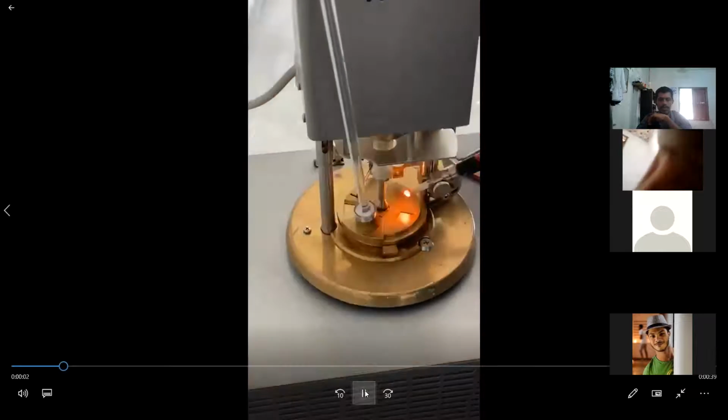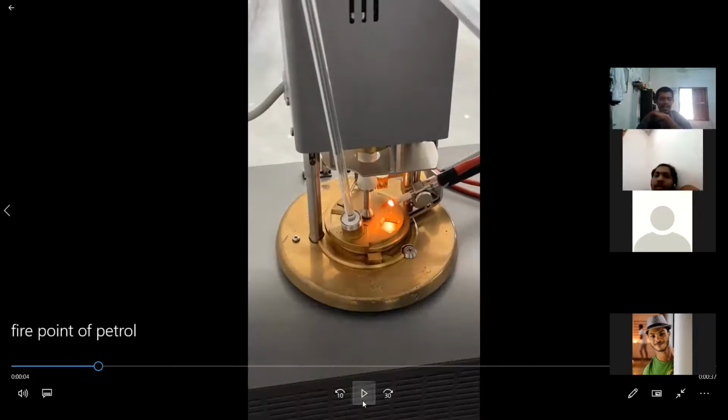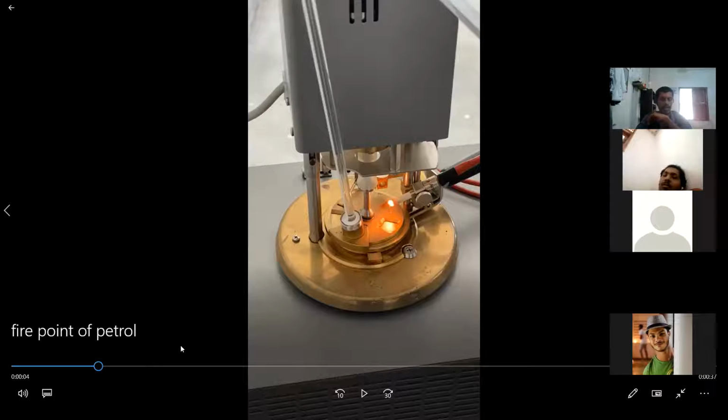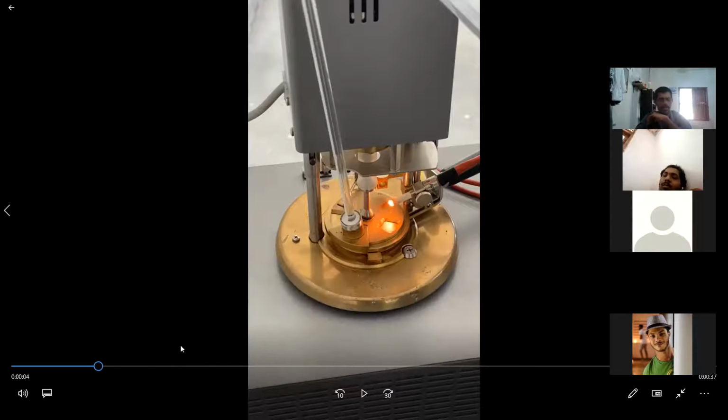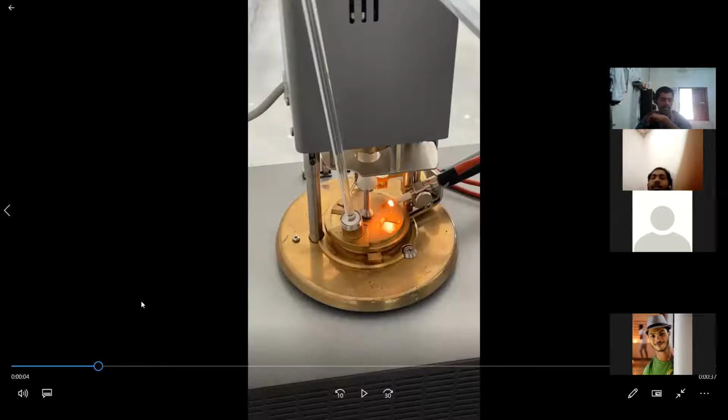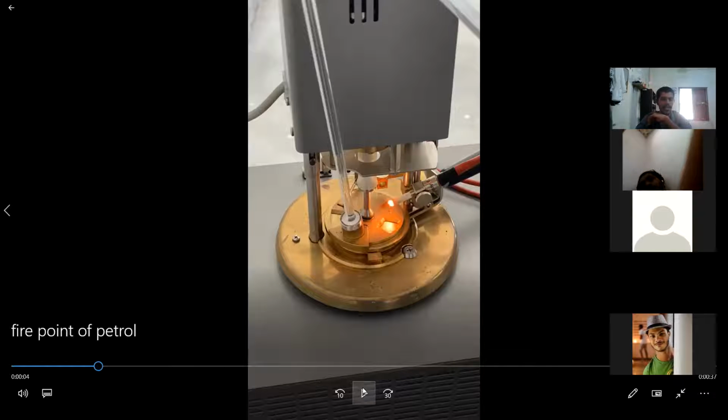You can see it is a yellow color flame now. When the flash occurs, it is mostly a blue color flame. And when it reaches the fire point, it burns for more than 1 or 2 seconds, burning continuously. That is the fire point, so from that we can identify that it reaches the fire point.